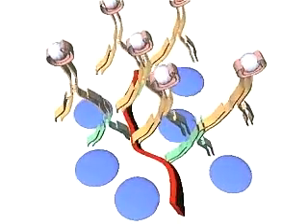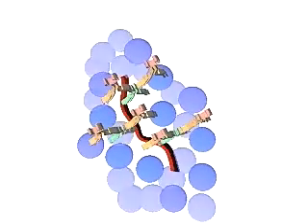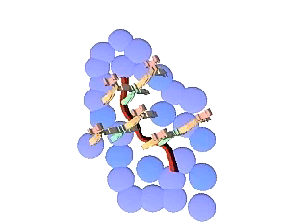The enzyme cleaves a substrate to produce a colored product that precipitates onto the membrane near the antibody. The blue-colored spot on the membrane shows the location of the enzyme-linked antibody and thus the position of the protein of interest.